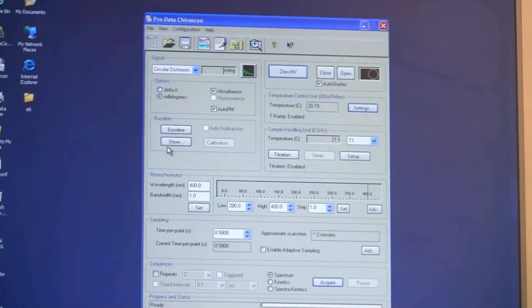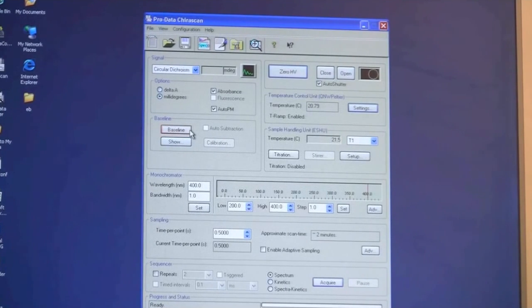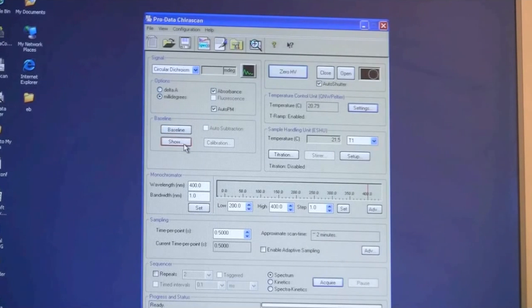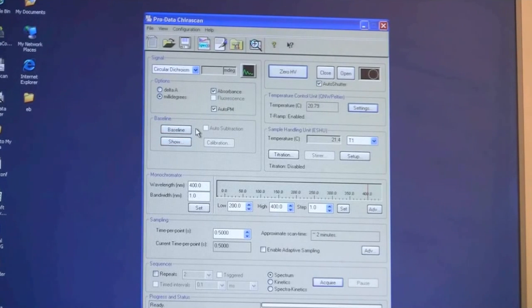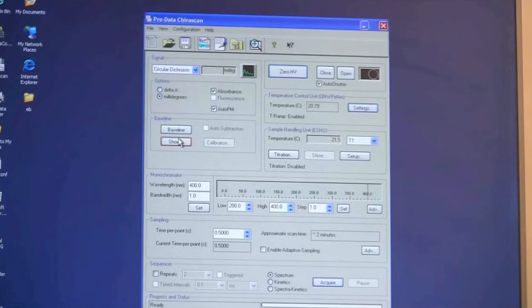On the left side here you have the option of collecting a baseline or showing a baseline. If you already have a baseline from an earlier experiment you can also load that in.